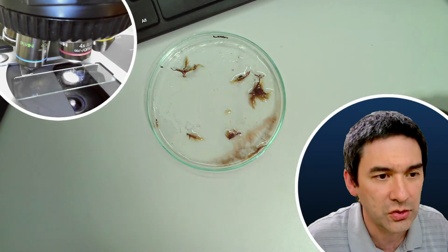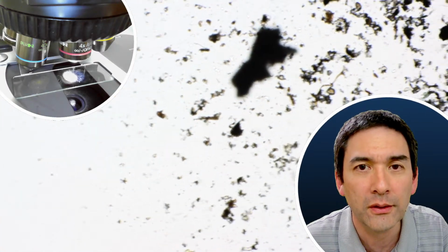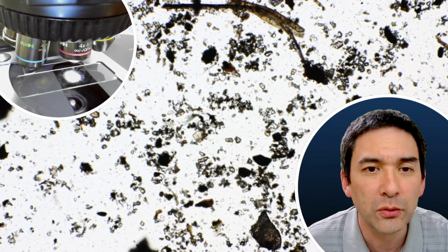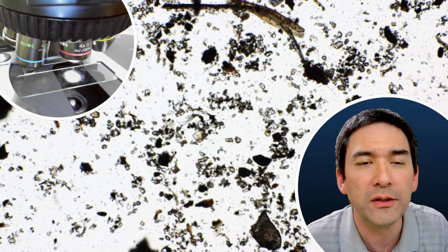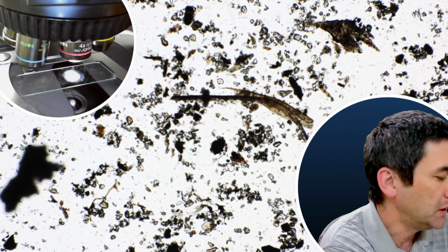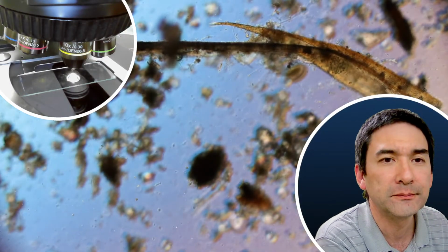I need to switch again, and that's basically what I'm able to see here. That's low power, and at this low power it's generally difficult to see, but you can see some movement here. I found a whole bunch of single-celled microorganisms as well. But we're going to switch over now to a slightly higher magnification.